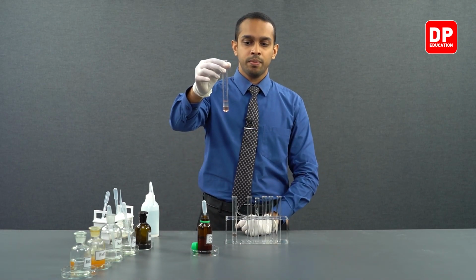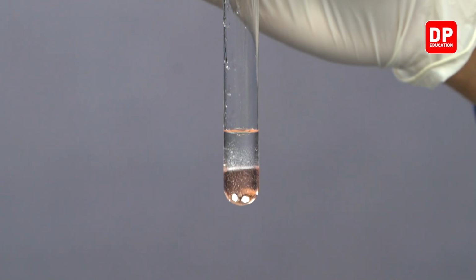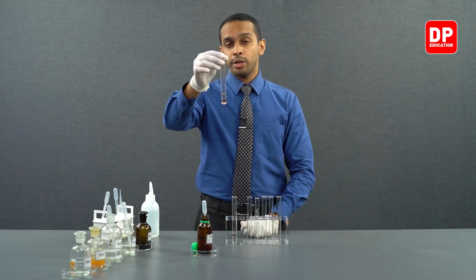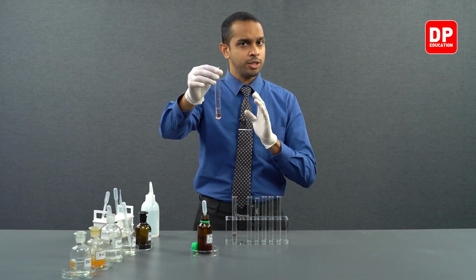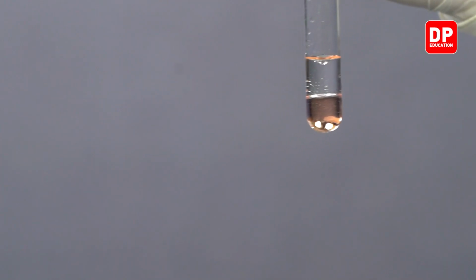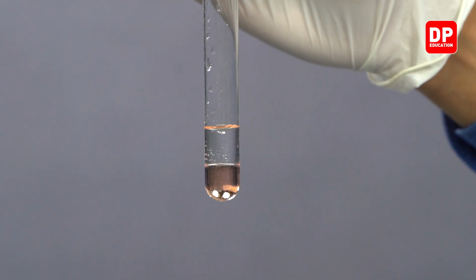You can see before mixing, you can see a little bit of layer separation here. We saw phenol is moderately soluble in water, but if I don't mix it, you will see the two layers separated like so.